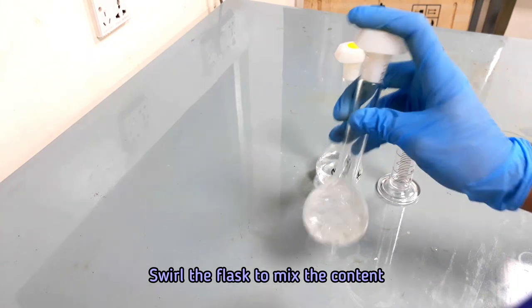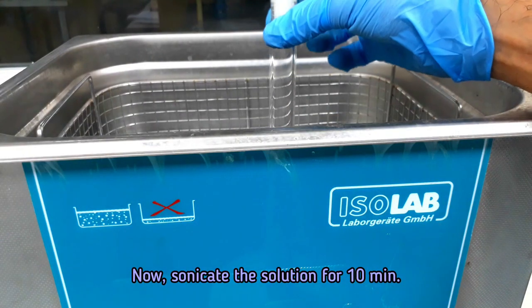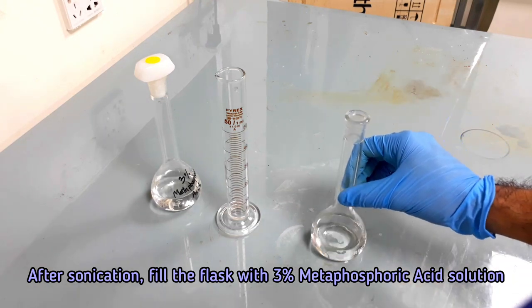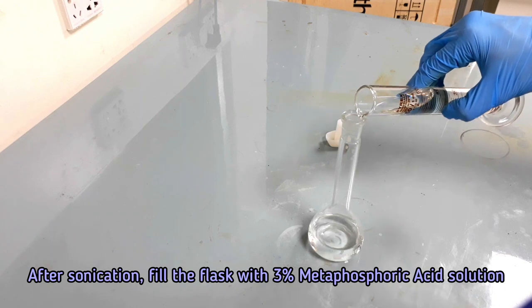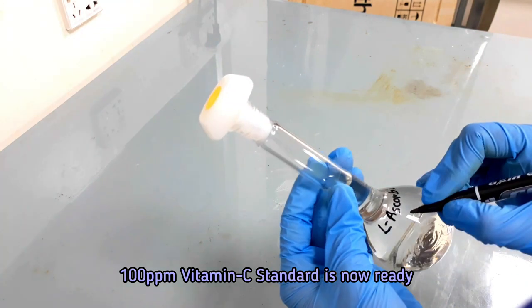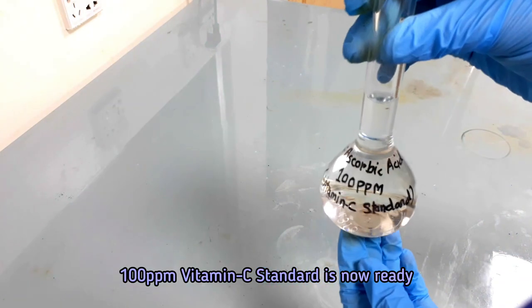Swirl the flask to mix the content. Now sonicate the prepared solution for 10 minutes using ultrasonicator bath. After sonication, fill the flask up to the mark with 3% metaphosphoric acid solution. 100 PPM vitamin C standard is now ready. Let's go for the instrument preparation.